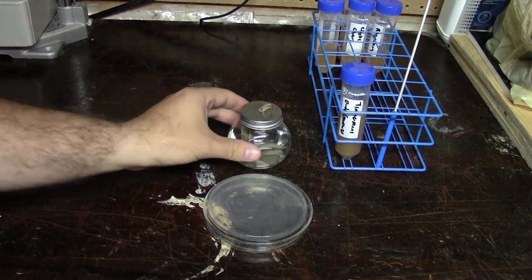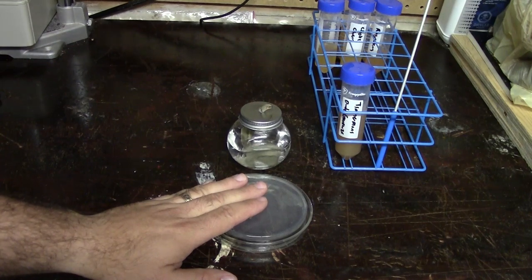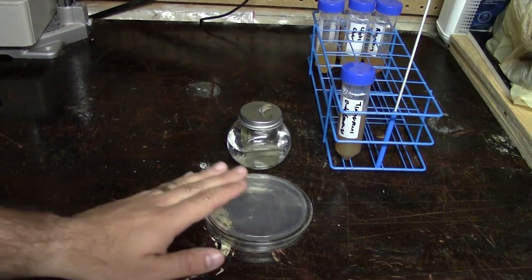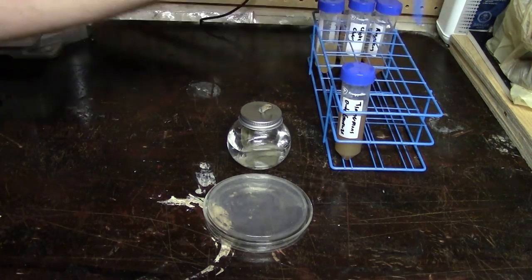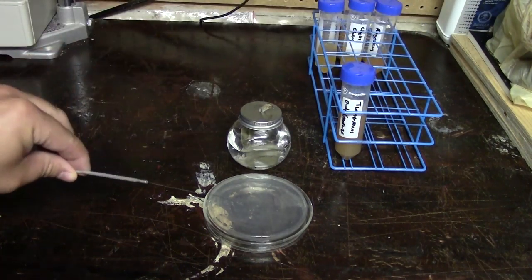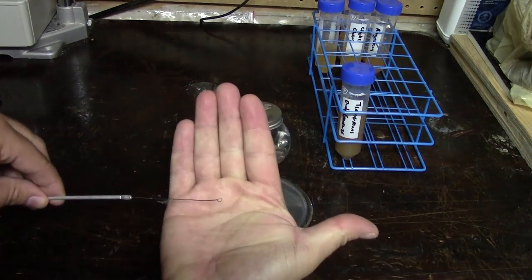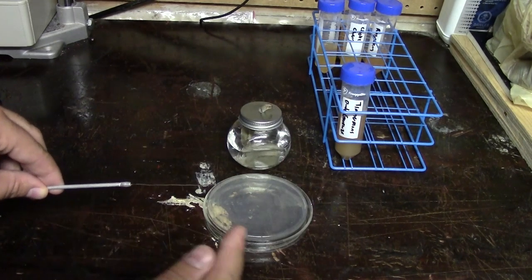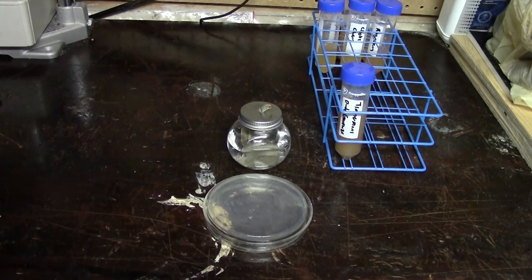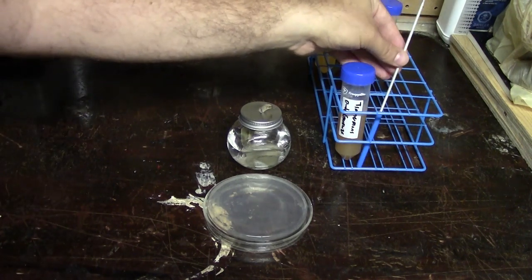You're going to need either a Bunsen burner or an alcohol lamp, of course your petri dish with whatever agar you're going to use and I'll talk about making these in a future video. And you're going to need a loop. This is kind of hard to see but basically there's a small ring here, perhaps you can see it now in metal followed by a little bit of an extension and this is used to sterilely transfer yeast and other organisms from point to point.